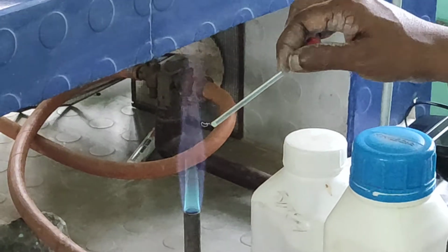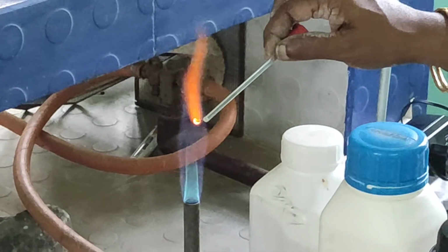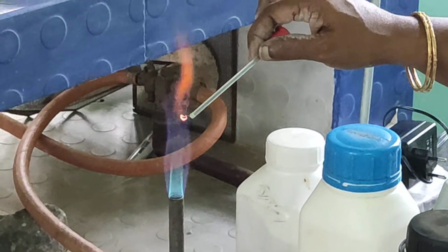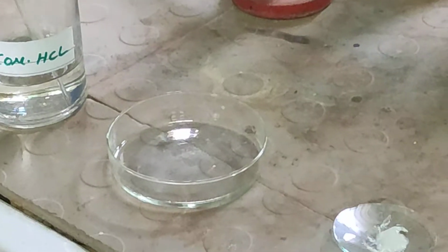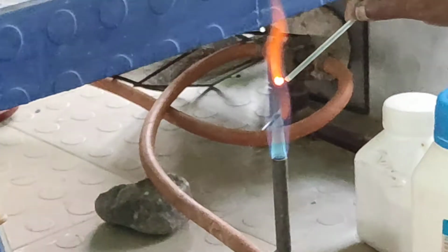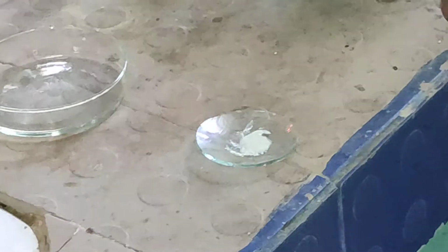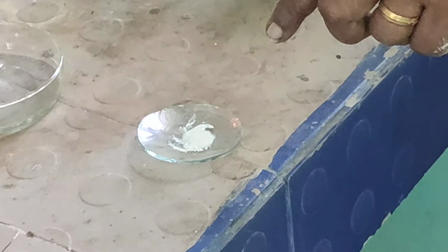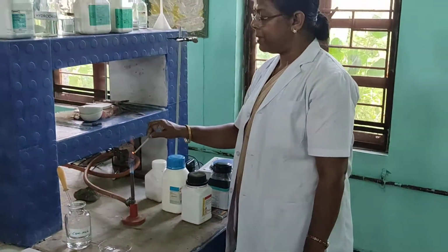You see, it is showing a color, and this is brick red color. So that means the salt which I have taken, which is imparting a brick red color to the flame, is a calcium salt. That means this salt contains calcium ion. We can confirm it by other tests. Now you can observe the brick red coloration.